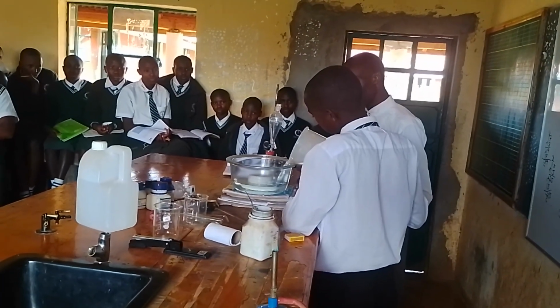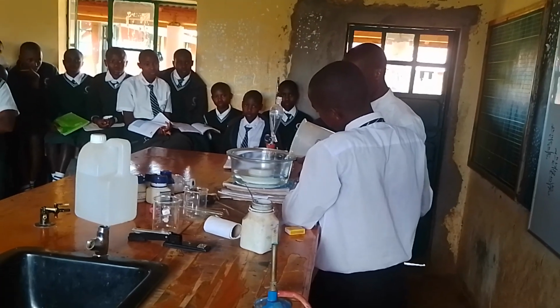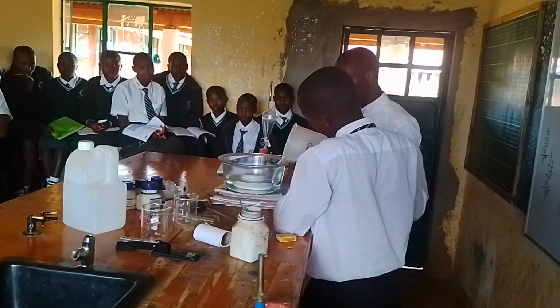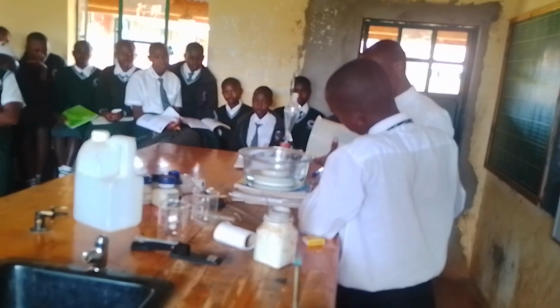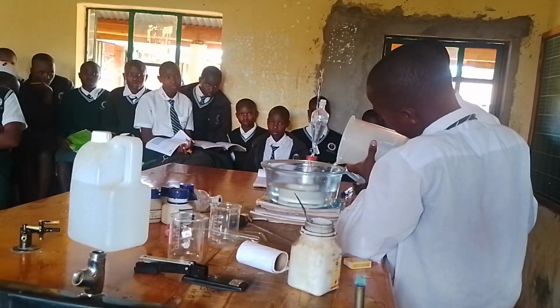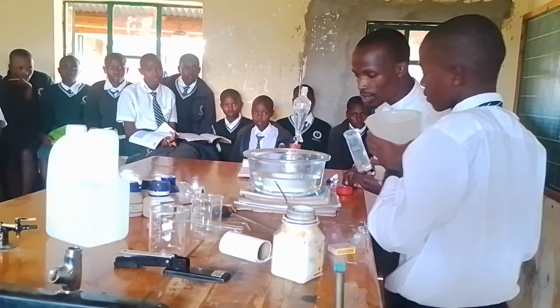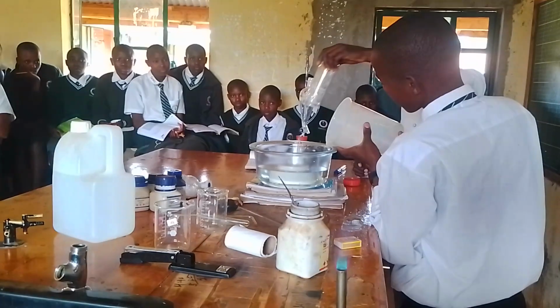Continue placing it. Yeah, go ahead. Yeah, the entire amount. Oh, nice. I want to believe it has come to the top of the beehive shelf.